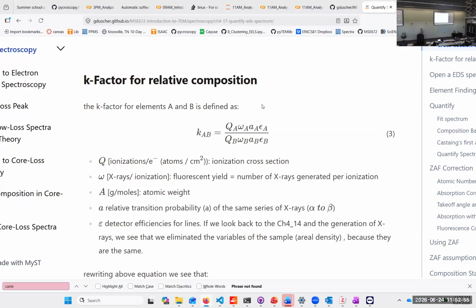Then you put oxygen in there. That's a bit more difficult, but then you use manganese oxide for something that you really know. So the way to get around it is to do that for a reference one.